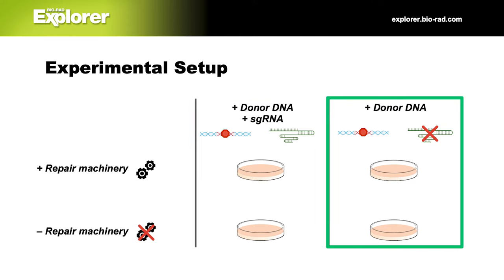Discard the tip. Use a new loop to spread the liquid evenly all over the plate, and then discard the loop when you're done. Repeat this process for samples B, C, and D using a new pipette tip and a new loop each time. Stack your plates and tape them together.